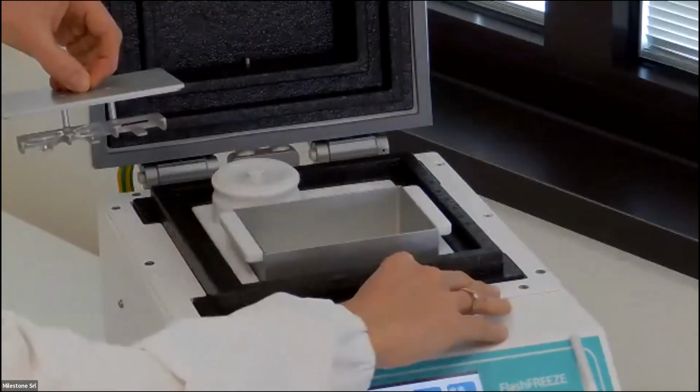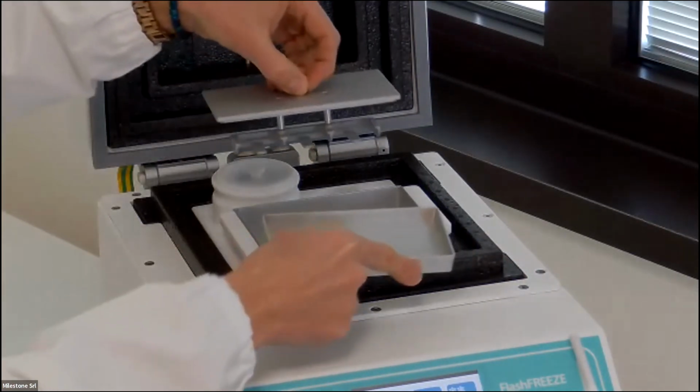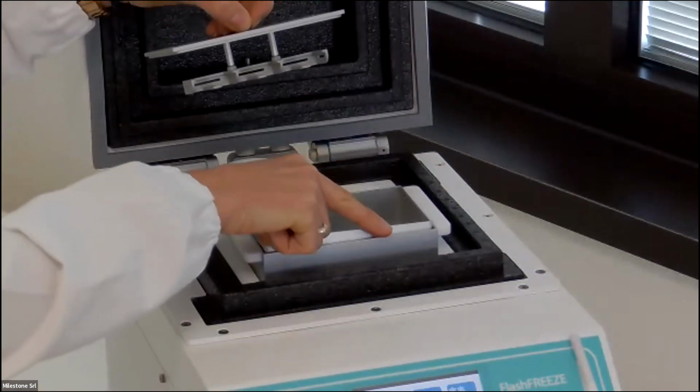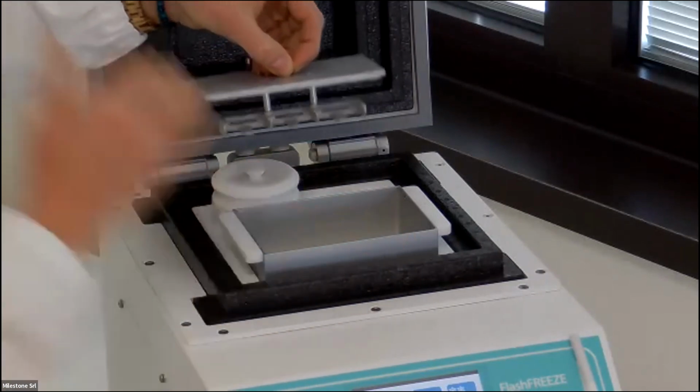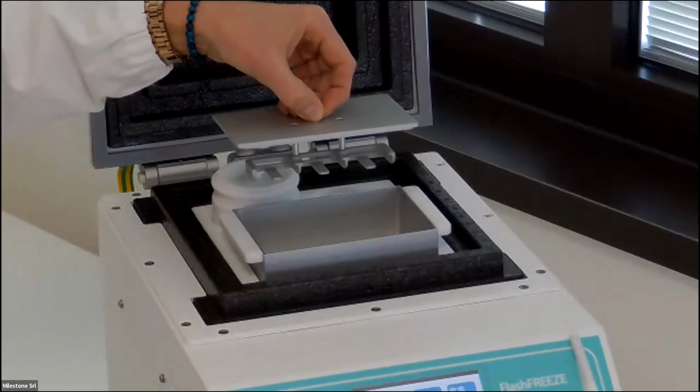Speaking about cryomolds, give me just a few minutes because I want to show you that in the cryomold kit, we have these 2 tools that I already explained to you. So the container to set the perfect level and the cover to immerse correctly the 3 cryomolds.